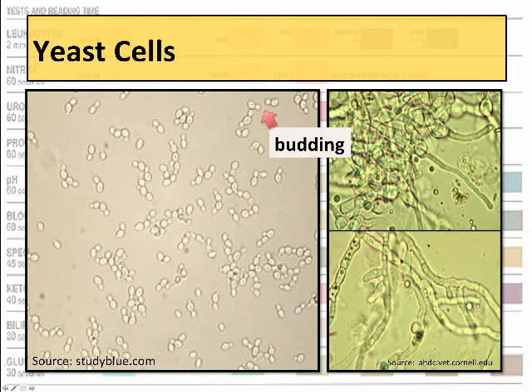Now, sometimes you will see this sort of hyphae growth. It's more filamentous than just singular here. This is kind of an interesting little setup. It's more of a fungal thing. It might not be just a yeast cell, but it's possible to see something that looks like this and have it be a fungal infection in the urinary tract.